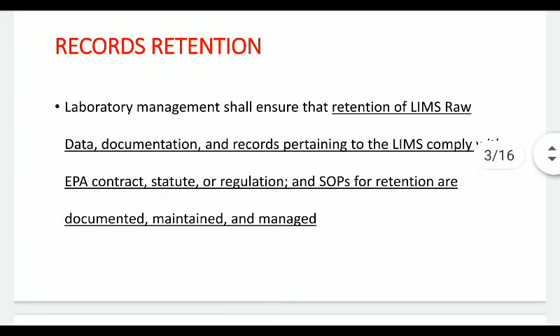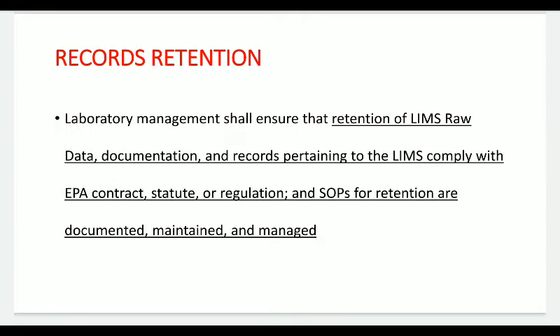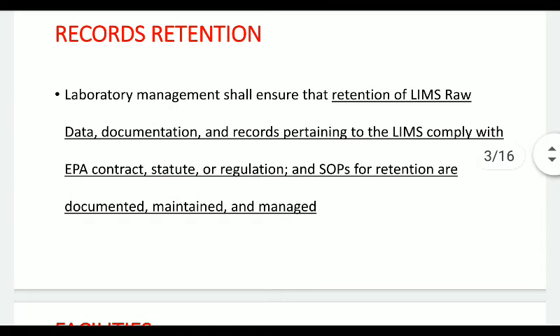Now it is the job of laboratory management to ensure a systematic retention of records. In case the laboratory management is not aware of how to retain records, specific guidelines are given by authorities.